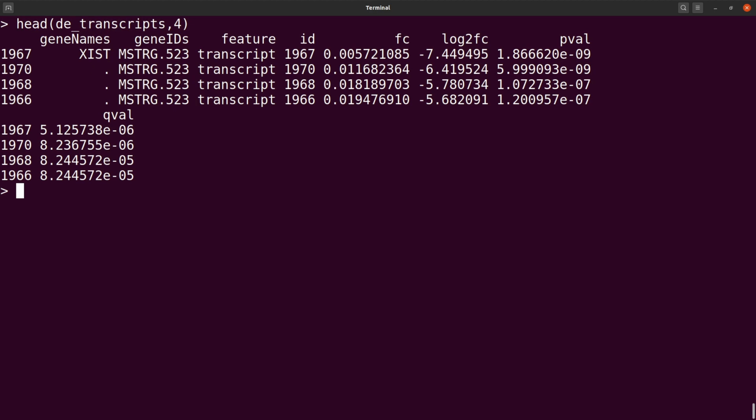It's very important. Depending on your research questions and what you have, you come up with a threshold that you'll use. You can also check papers and publications, look at what thresholds have been used, and then adapt them. You also need to consider the organisms you are using, sample size and all that. So that's one. There wouldn't be a fixed threshold, that's what I'll say, but there are best practices.